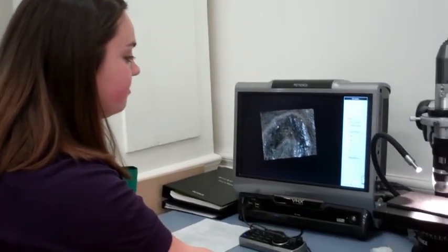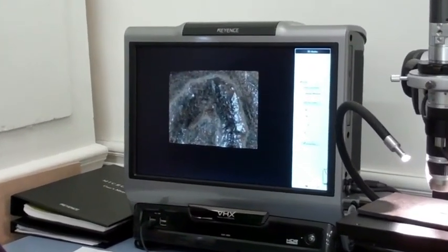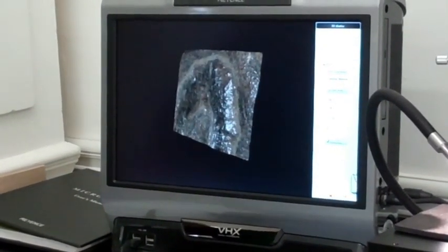We can see these images as a 2D file or a 3D manipulatable file, which we can spin around and look at different heights and take measurements for our reports and blogs.